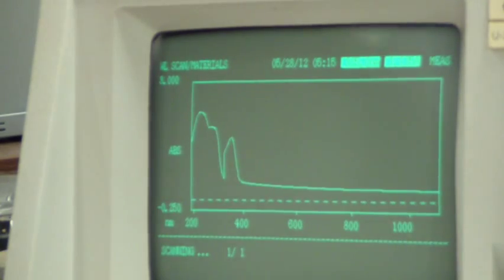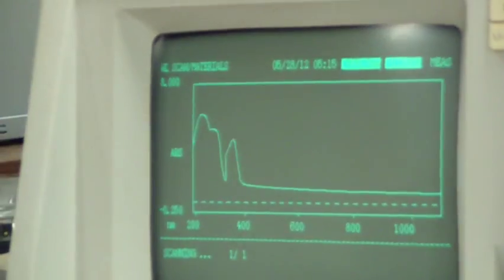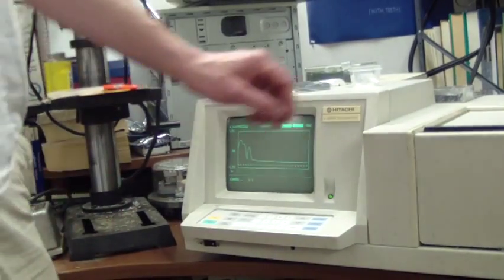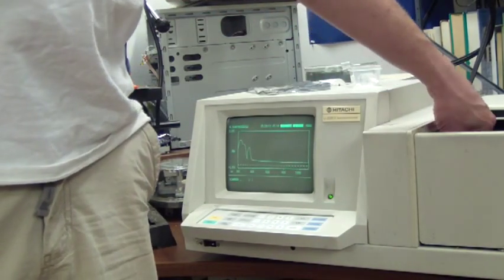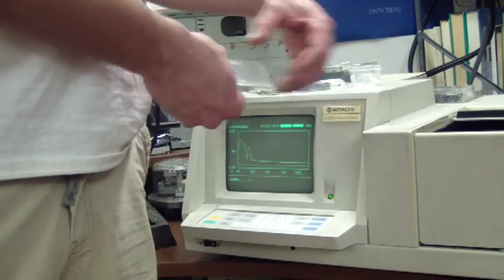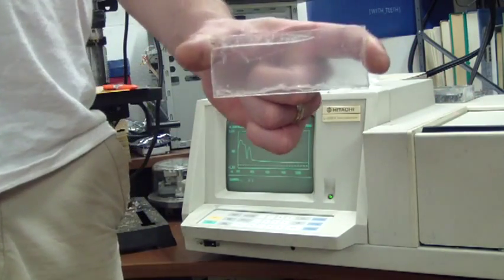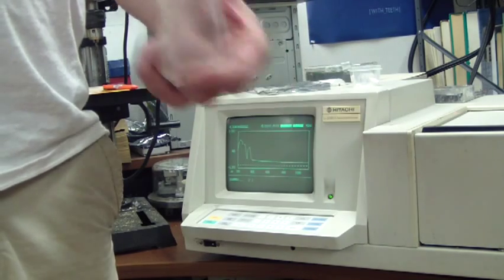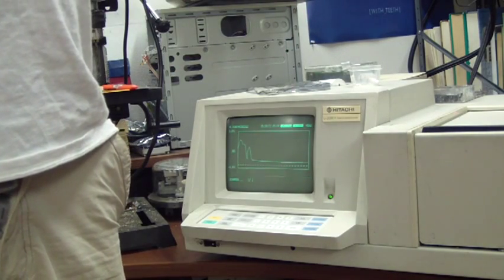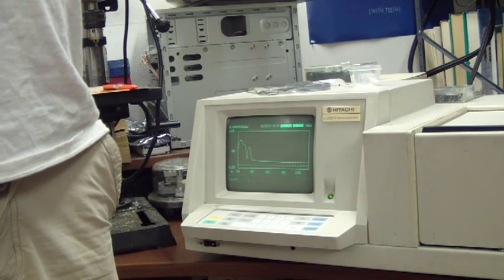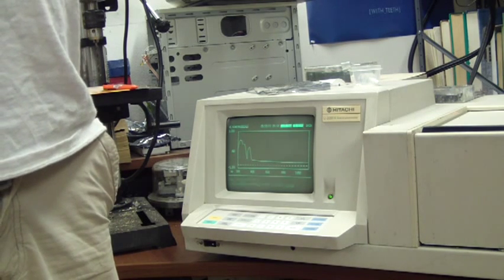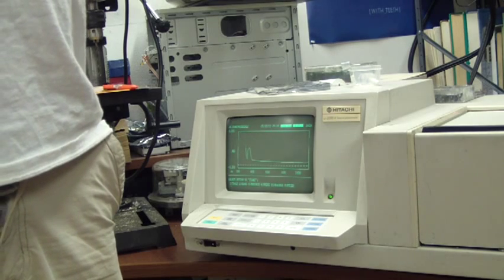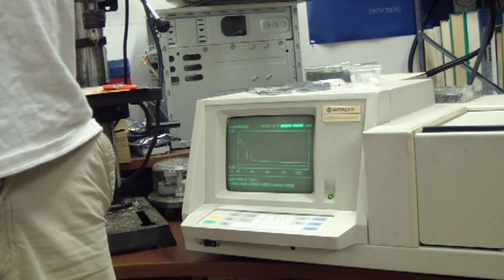Now I am going to remove the sample. You can see the protective coating is still on it. I am going to remove the protective coating and scan again. What I am looking for is any noticeable difference.